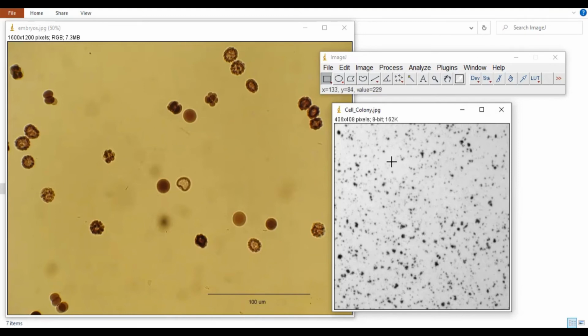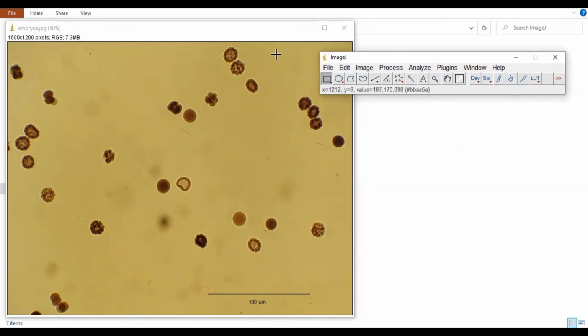So for this reason, you can get a false positive result when calculating the average particle size using ImageJ, or you can get an inaccurate result. So it's preferable to use your result from SEM or TEM where the particles are distinguishable.